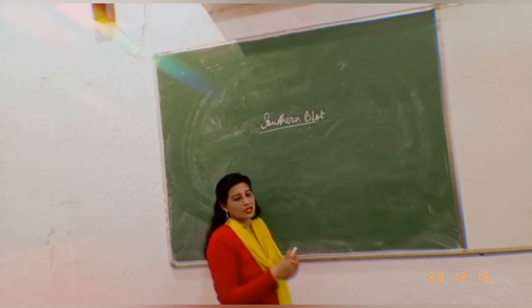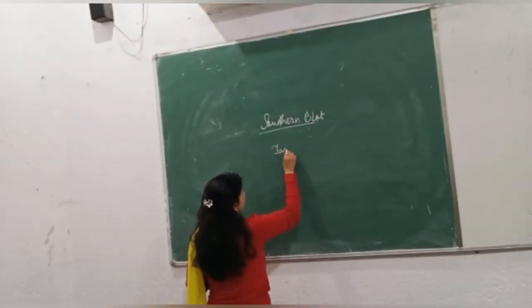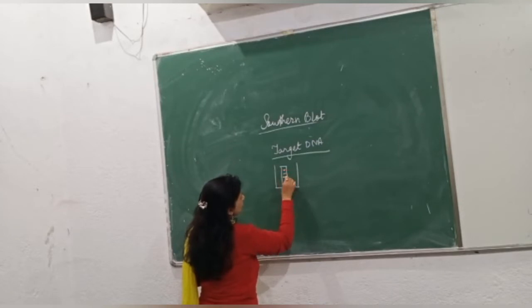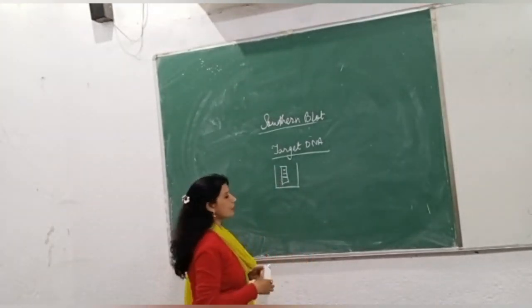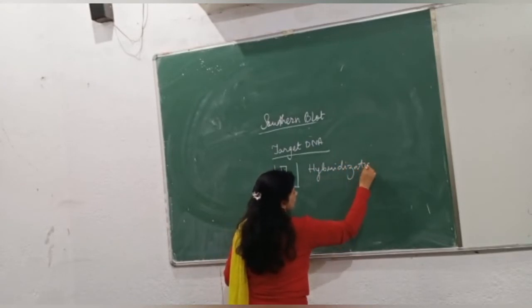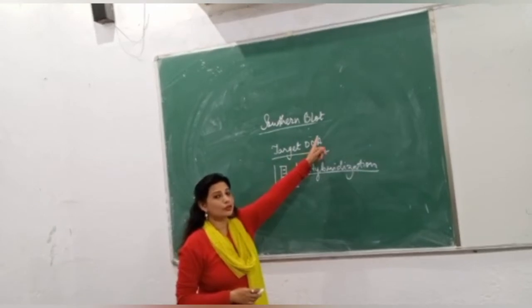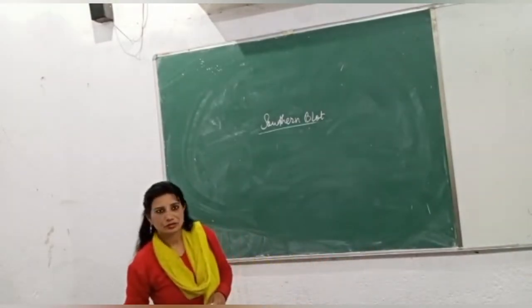So here is the problem which I have faced, and I need to resolve it. The problem was how to locate my target DNA sequence, the particular gene sequence. And I have got my total bands from the gel electrophoresis method. Here comes hybridization, but before I make a hybrid, that is rejoining, I have to get single strands also. So this is also a problem. What I will be doing is using another method, the southern blot. Finally, I have come to this method, southern blot, and in this method, what I need is a particular chamber prepared.